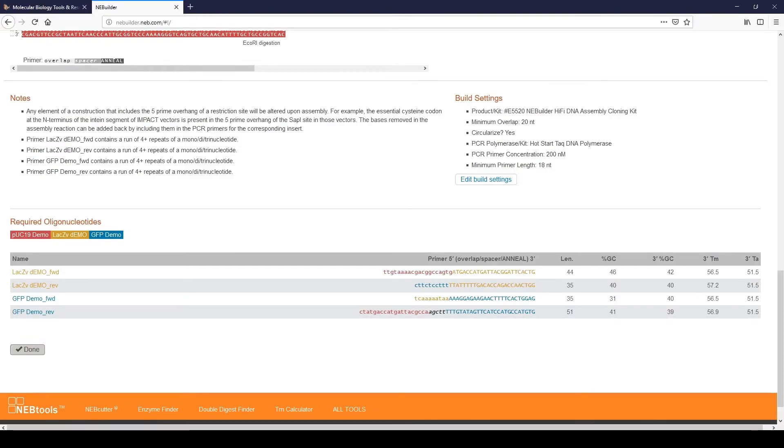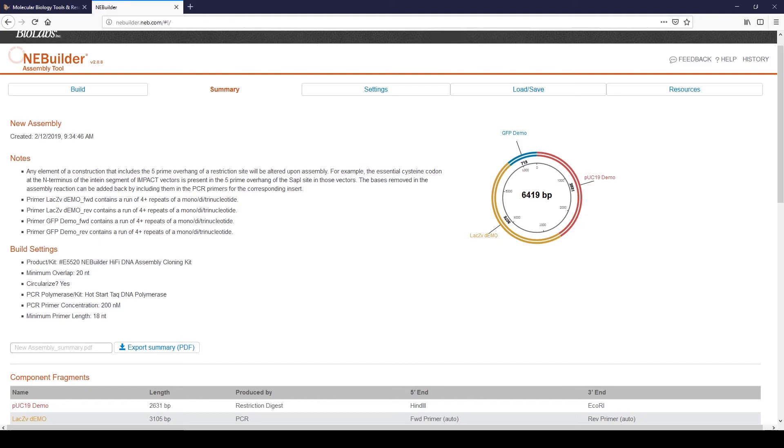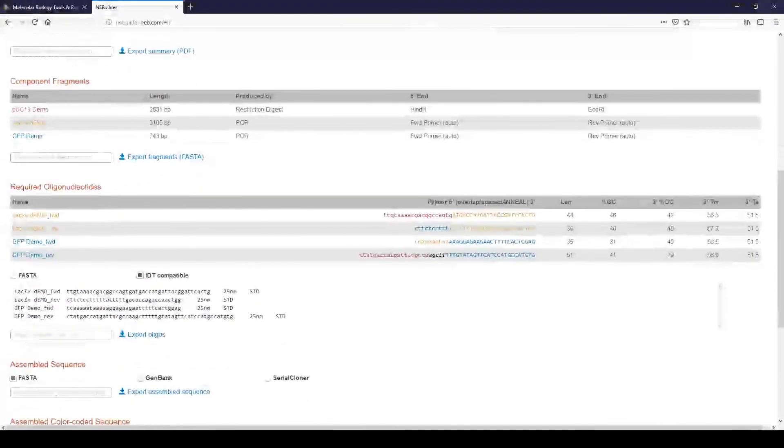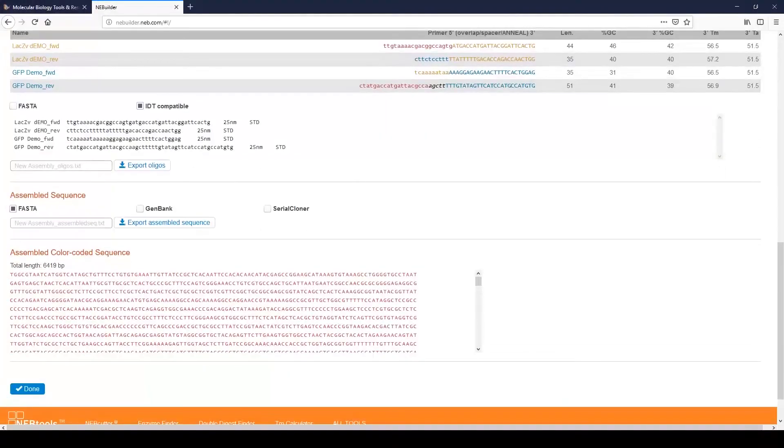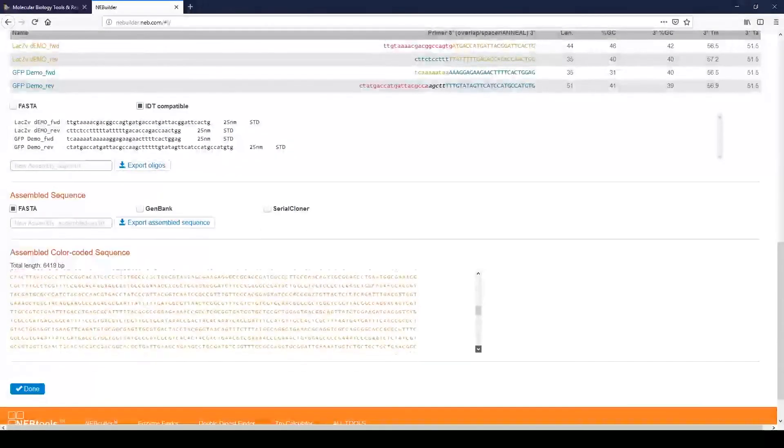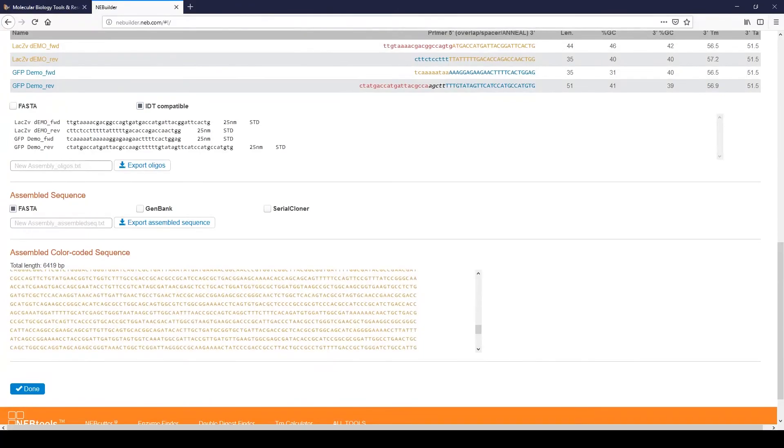On the next page, there will be a summary of your assembly. This summary page contains information on the fragments, the oligos required for PCR, which can be shown in FASTA or IDT compatible sequence formats, as well as the TM and annealing temperature of those oligos. There is also a simple map of the assembled product, a sequence in multiple formats that can be exported, and a color-coded sequence that you can easily identify the assembly junctions.